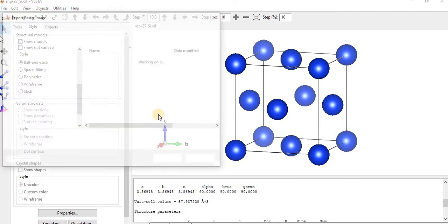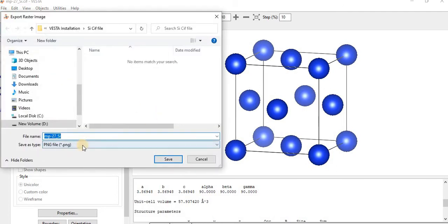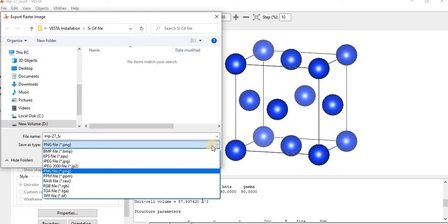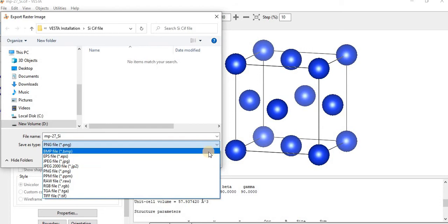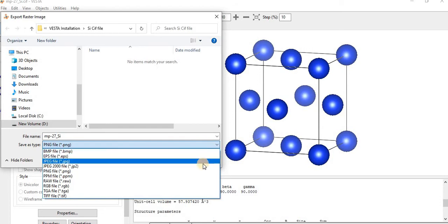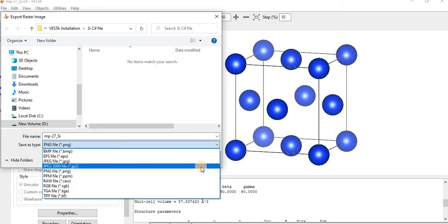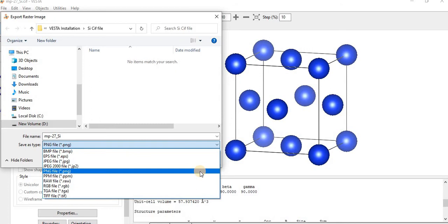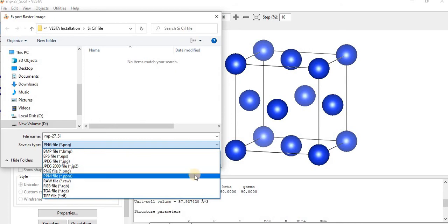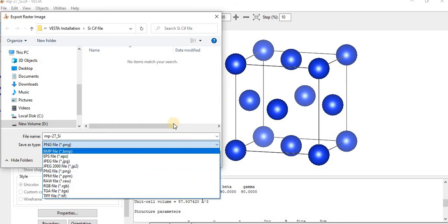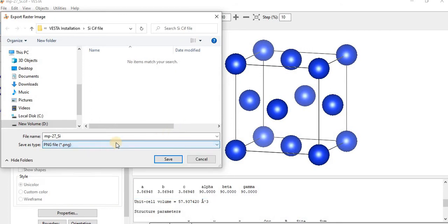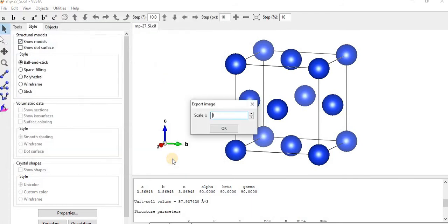When you click this drop-down menu there are a lot of formats: BMP, JPG, PNG, and other files. If I want to save this in PNG, I click on PNG and then save. Okay.